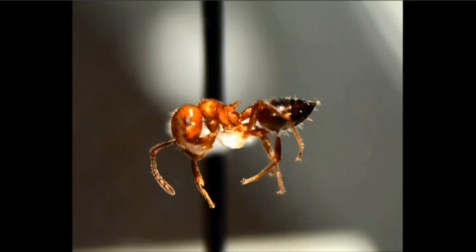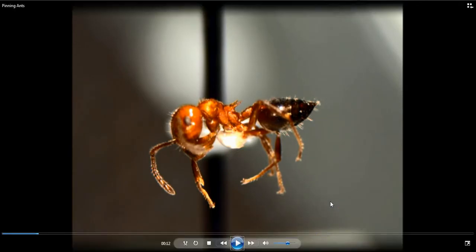I want to put this little video together to show you how to pin ants. The reason I want to do that is because it's really hard to show people while I'm looking through the microscope.